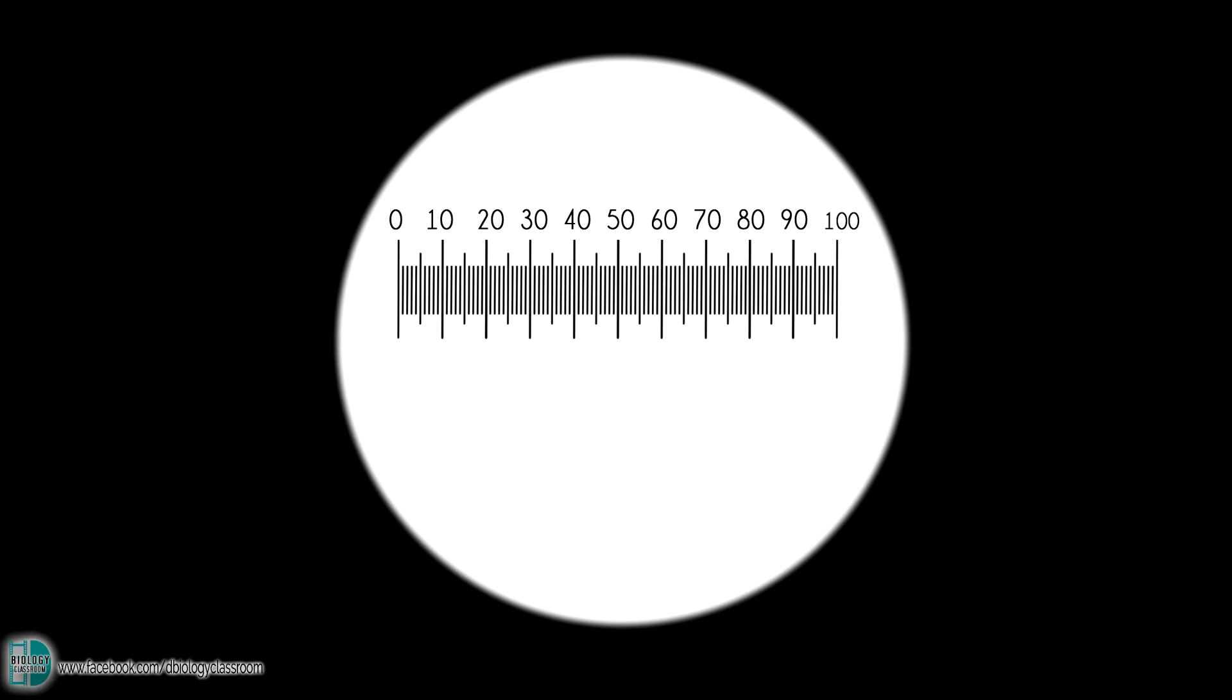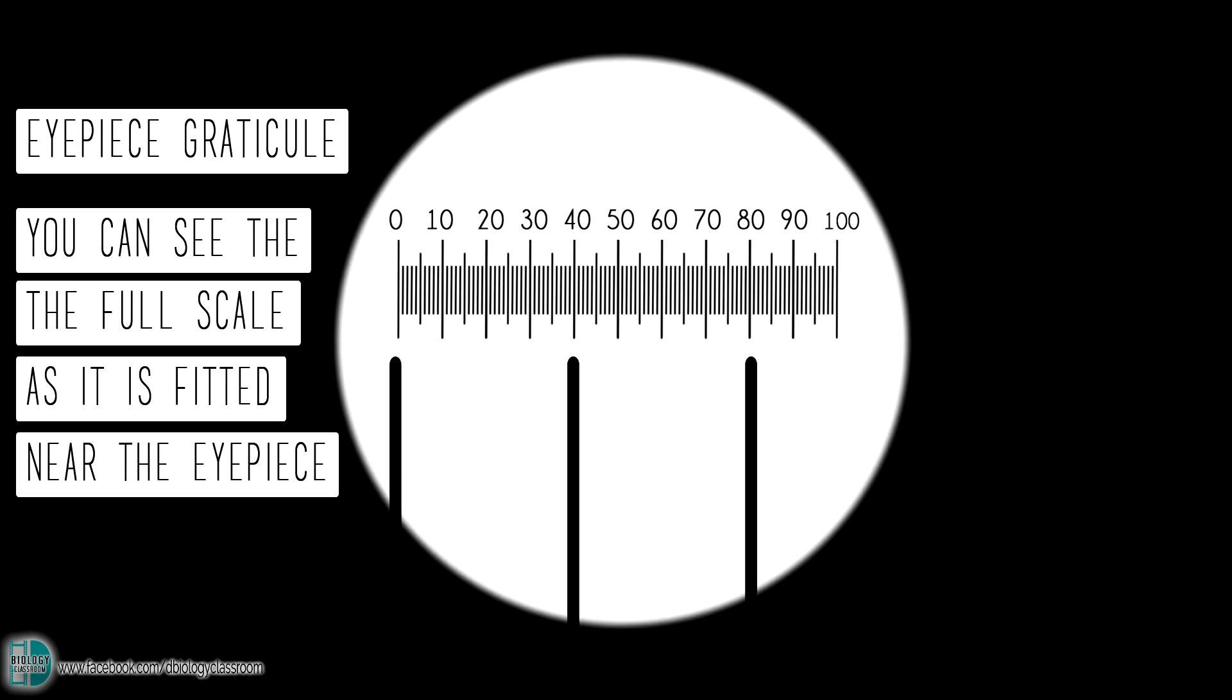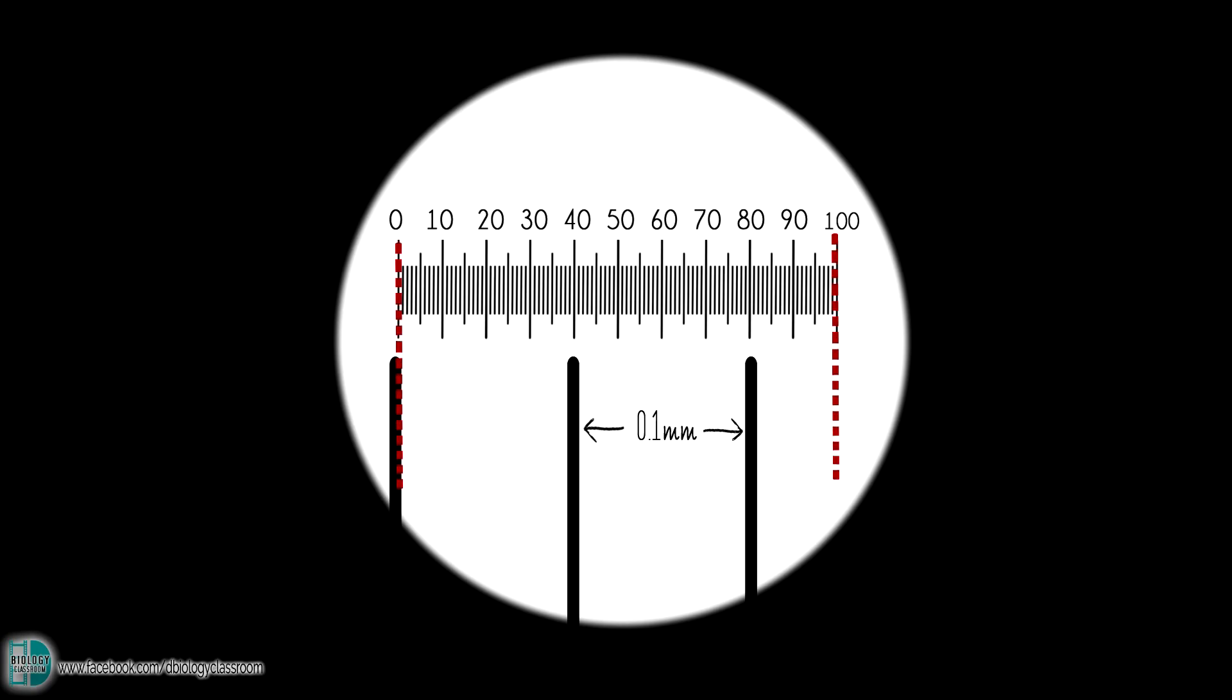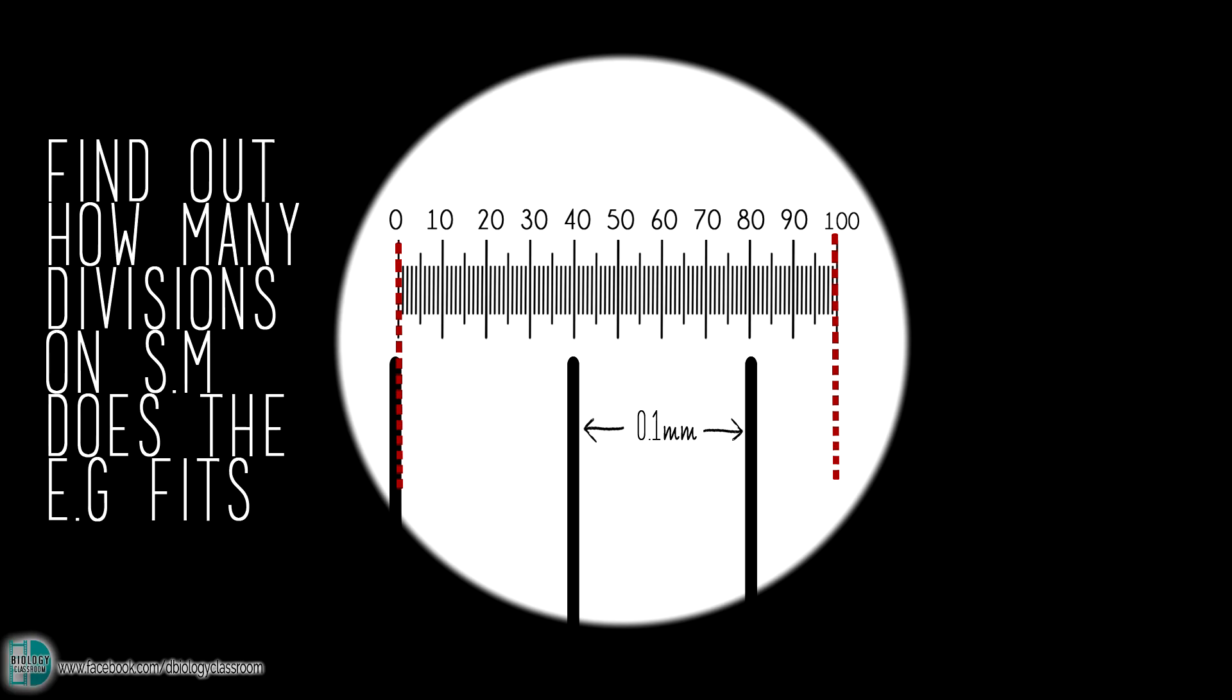This is how an eyepiece graticule should look like. You can see its full scale because it is fitted at the eyepiece. It normally has 100 divisions. When you view a stage micrometer, you can only see part of it because it has been magnified. The stage micrometer we use usually have a smaller division of 0.1mm. Align both of them and find out how many divisions on the stage micrometer does the eyepiece graticule fit into.